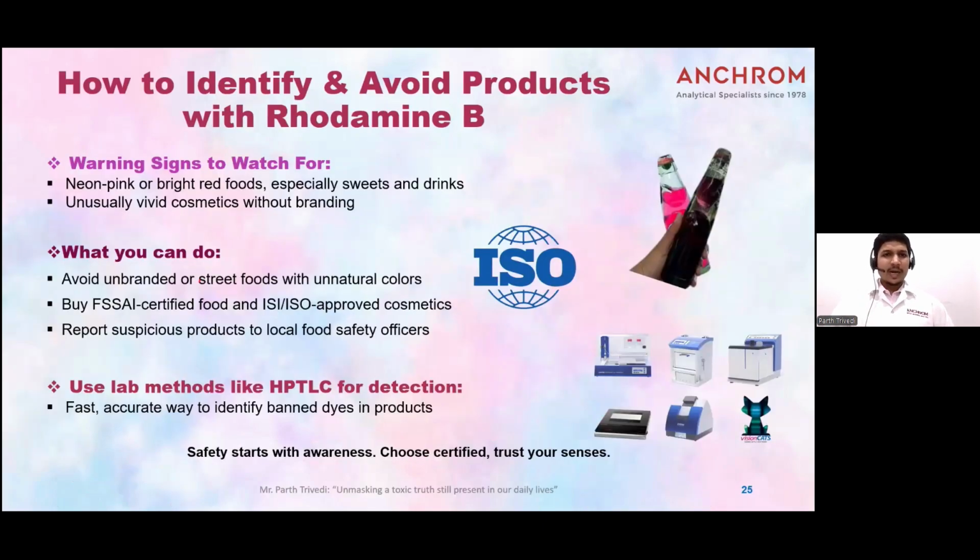Now, how to identify and avoid products with rhodamine B. As you know, first of all, remember that whenever you see neon pink and bright red color, these are the main red flags for you. So you have to always be aware of it. And of course, in the lab, we rely on HPTLC, a fast and reliable method to detect such banned substances, as you've seen in the previous slide also.